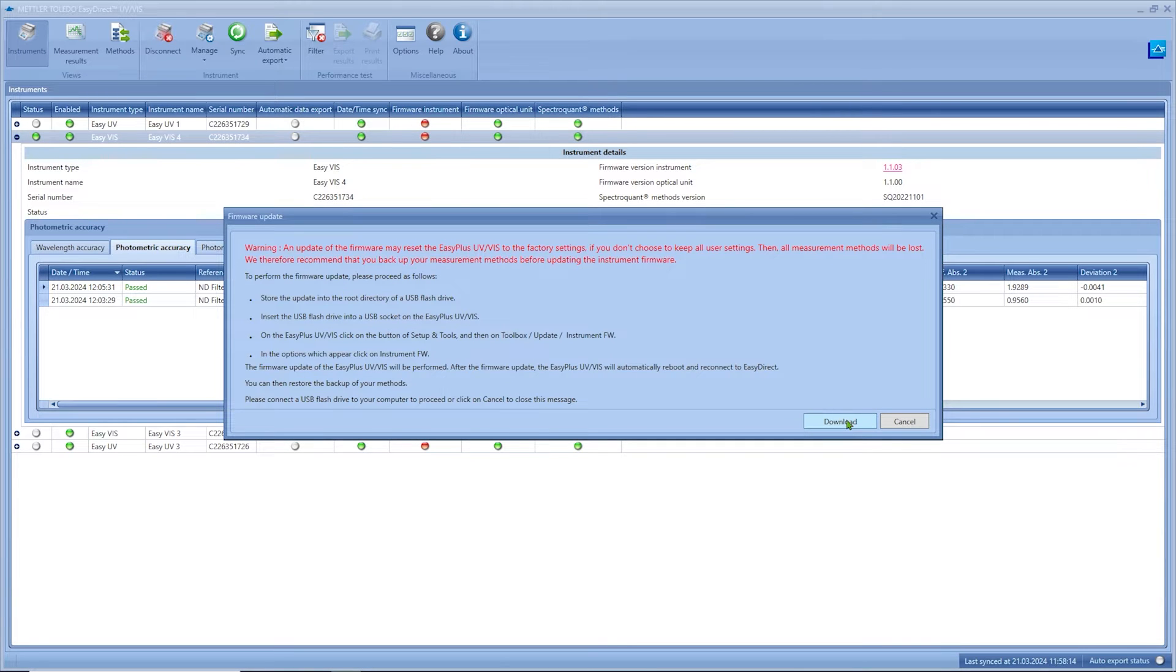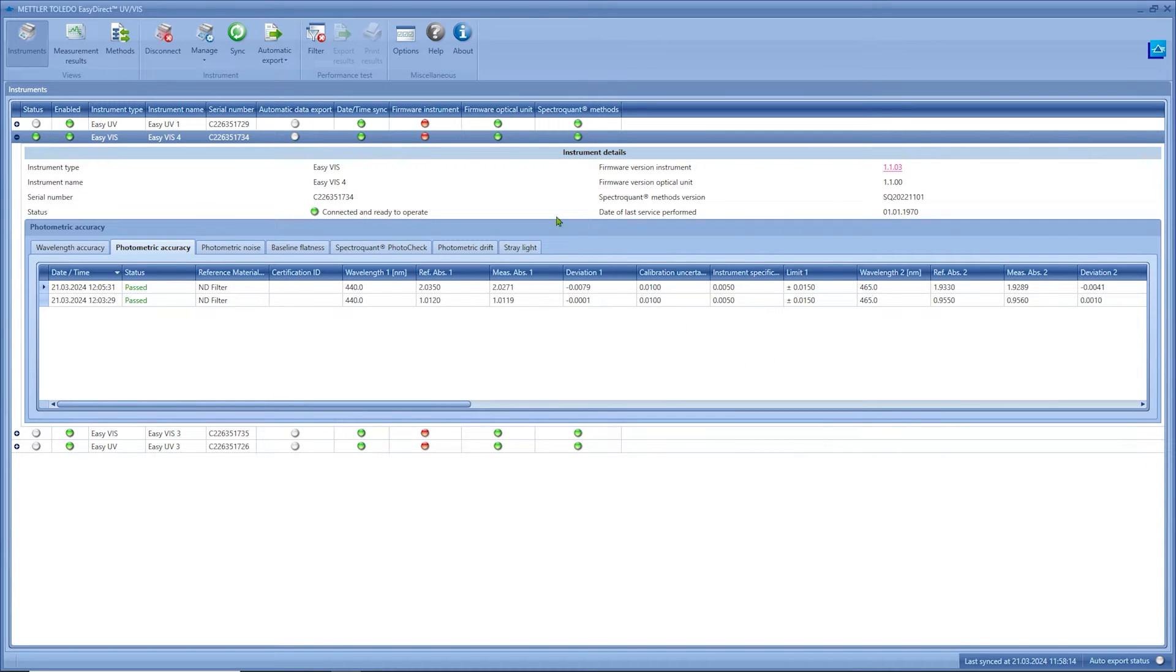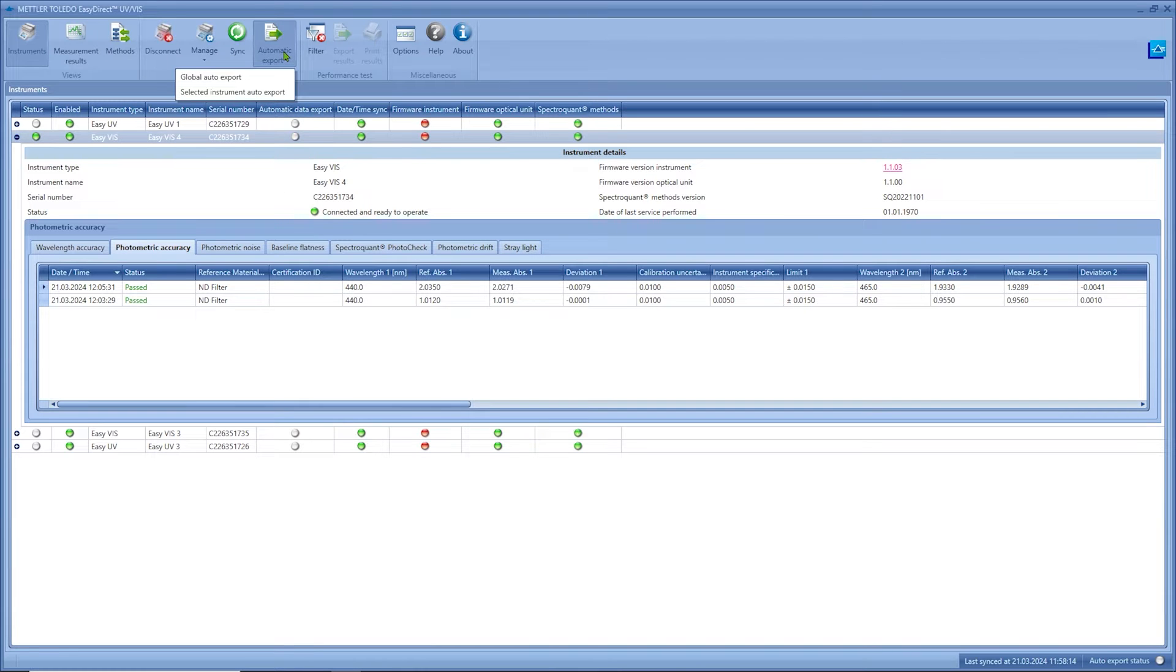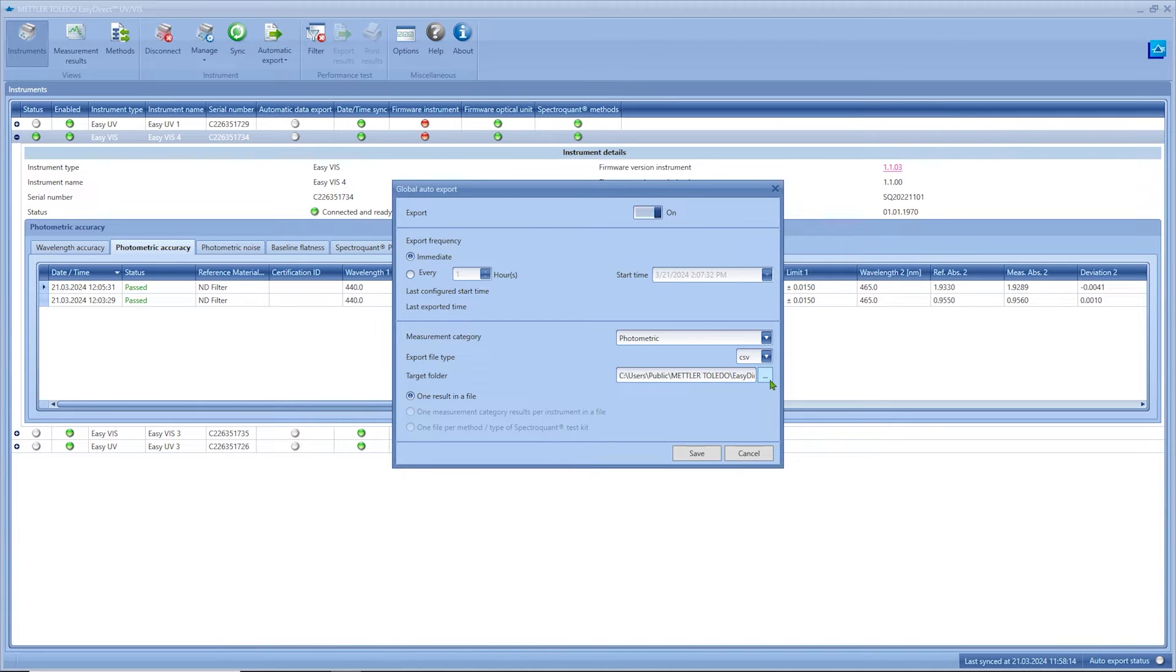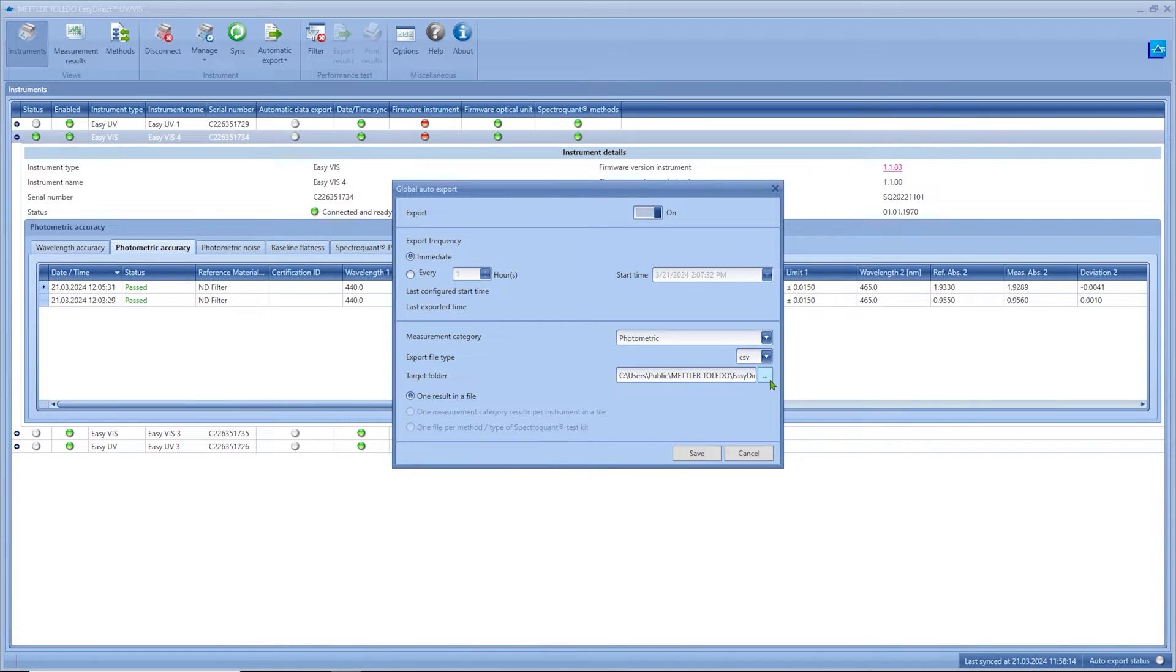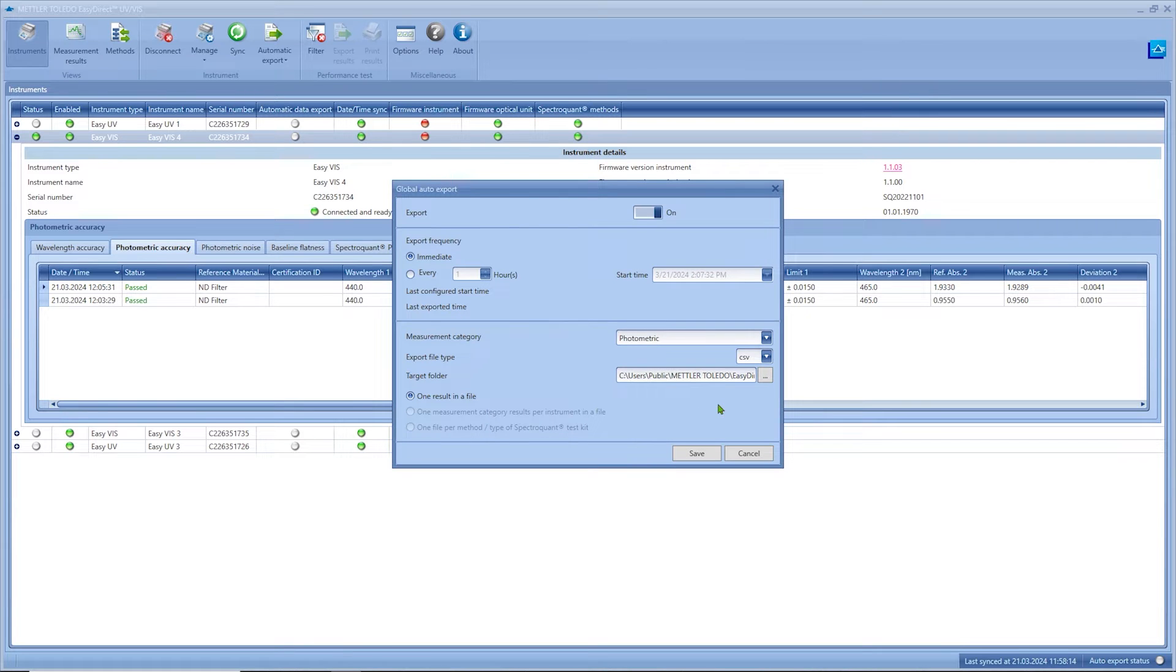In this instrument view you also have the possibility to define an automatic export from EZ Direct to a storage location of your choice. This can be done in certain time intervals or every time when a new result is transmitted to the software. This feature enables the automatic export, for example, to a folder managed by your local LIMS system.